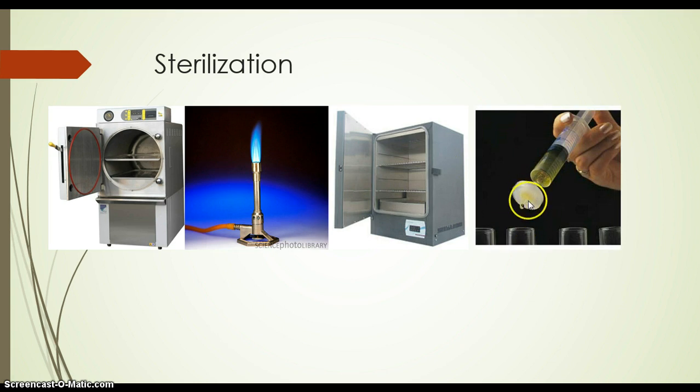You have a little filter right here that has really small pores, big enough to let chemicals through, but small enough to allow bacteria to be filtered out. You have this nice little setup with a syringe, and then you put your filter on. I think she might have passed around one of these in class. But yeah, that's how you filter sterilize stuff.